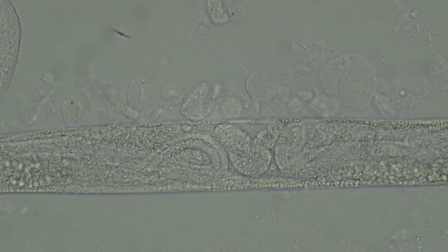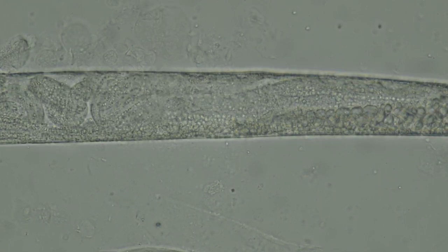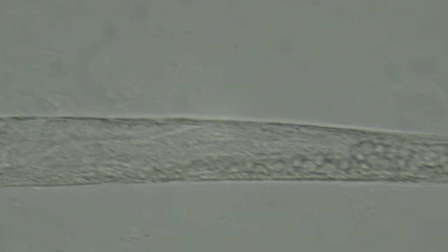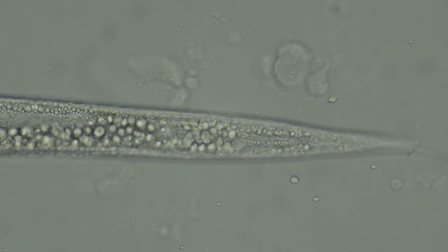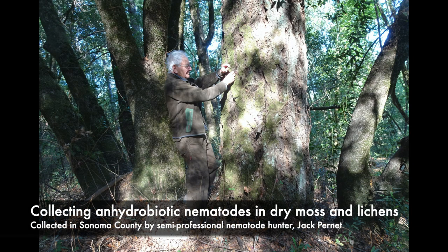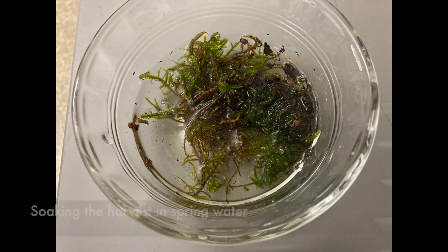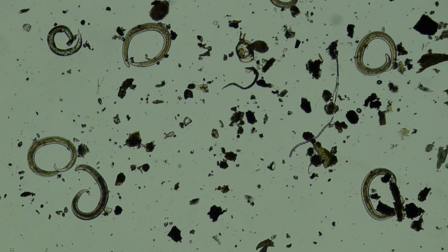This female is not in side view, so we cannot see her gonopore or anus. I also caught some wild nematodes in moss my father collected for me in Sonoma County. After soaking it in spring water I found lots of bdelloid rotifers and also lots of these coiled anhydrobiotic nematodes. I'm sure that these are alive, but they did not become active in the two or so hours that I watched them.